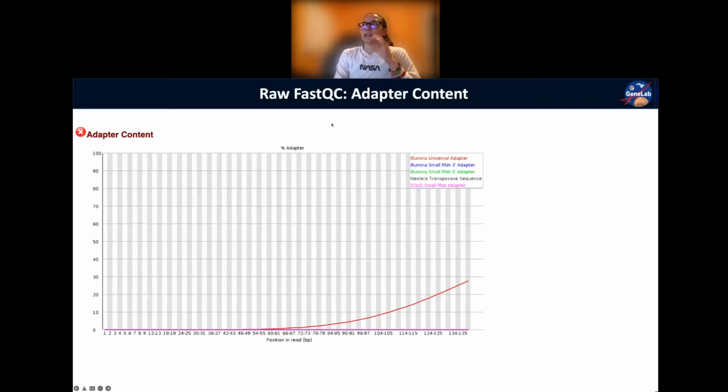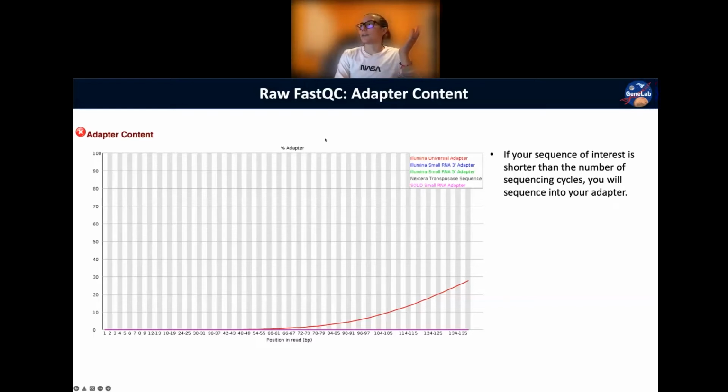FastQC has built into the tool a list of the adapters used by common sequencing instruments. You'll notice a bunch of Illumina instruments and older-school Nextera and SOLiD adapters too, which are different sequencers.